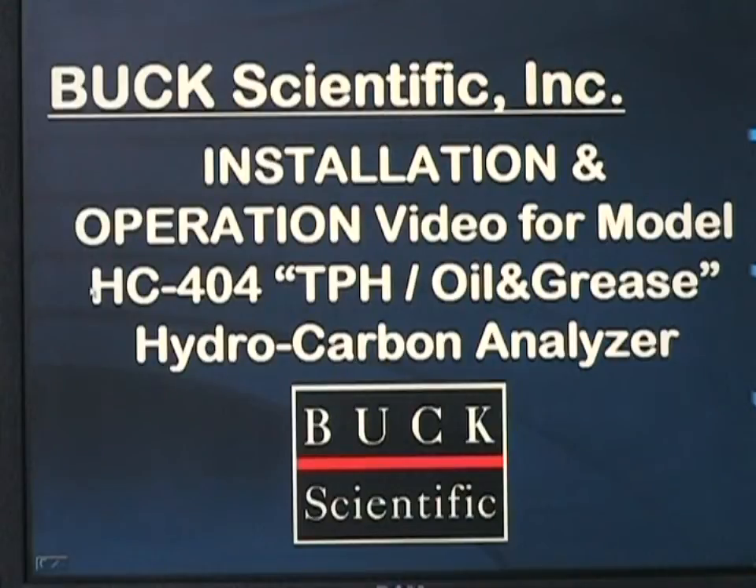This is the basic installation and operation training video for the Buck Scientific Model HC-404 Total Petroleum Hydrocarbon and Oil and Grease Hydrocarbon Analyzer.